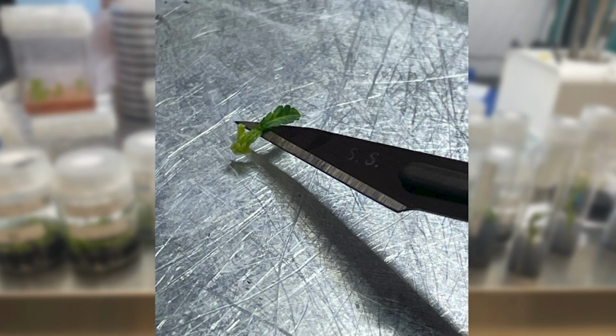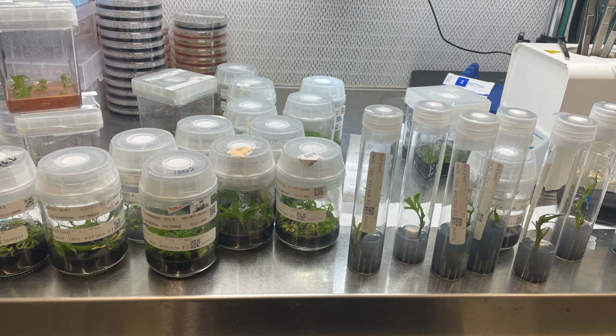Hi. So one thing that I do is tissue culture, it's a laboratory technique. We use this technique to grow and maintain cells, tissues, small pieces of organisms in a controlled, sterile environment outside of the original specimen. It involves placing a small piece of tissue onto a nutrient-rich, hormone-rich medium and maintaining it under a very controlled environment.